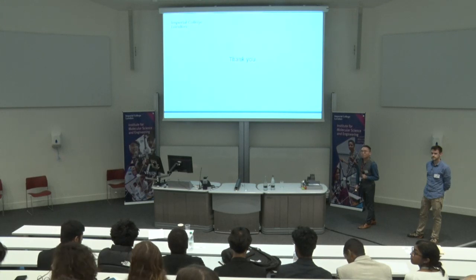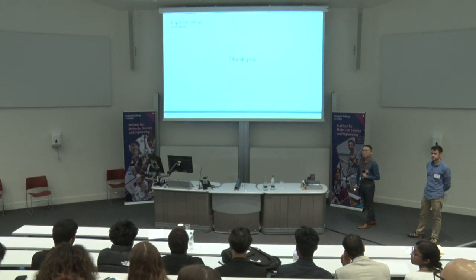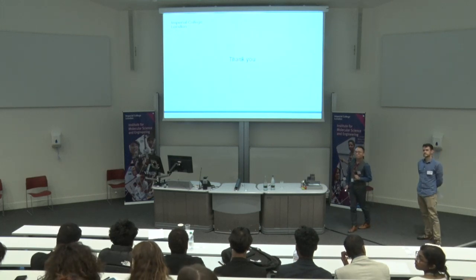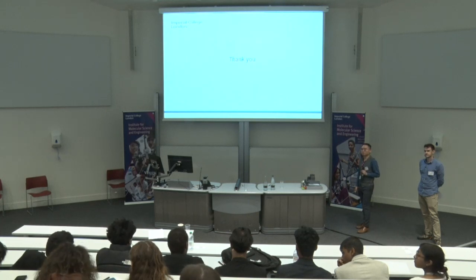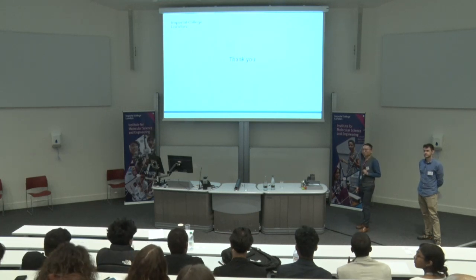I'm assuming that the paintings were unvarnished, yes? Yes. We have crust directly on the paint layer. I was wondering, and I know it's not part of this research project, but if the painting was varnished, would that hinder, stall, or affect the formation of white crust? Do you know anything about that? You mean if we had a further surface layer, assuming that there's constant migration, would that affect it if the painting was varnished?